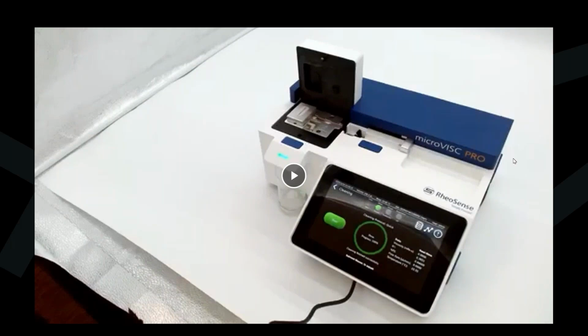So that means as long as your samples are compatible, you do not need to clean the chip in between, and you can run sample after sample, which saves a lot of time. But I would recommend cleaning the chip at the end of the day and preparing it for the next day's measurements. That would be a good practice. But during the day, if you run compatible samples, there is no need to clean the chip in between.